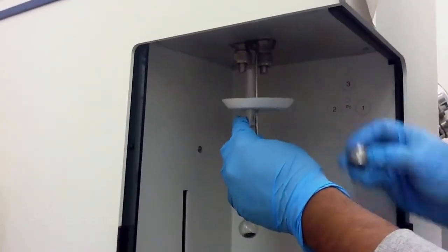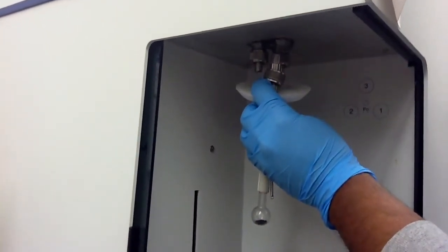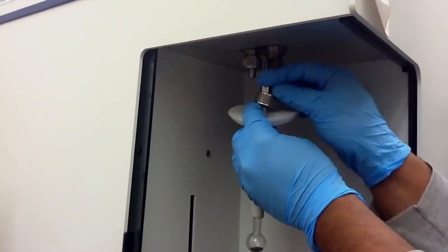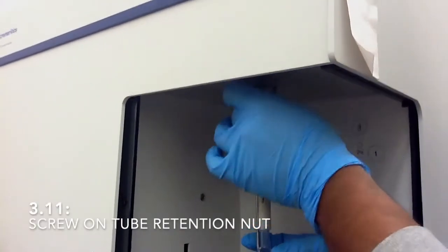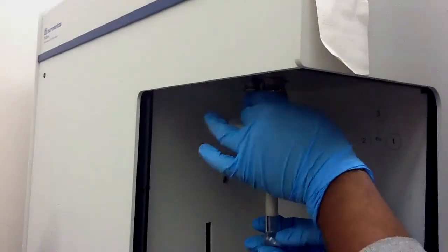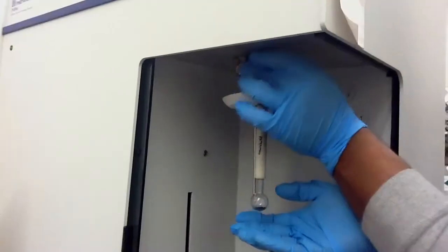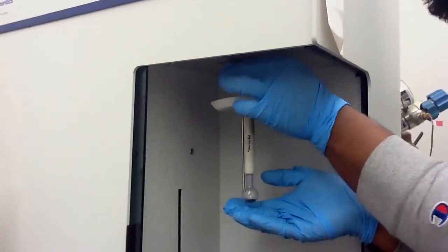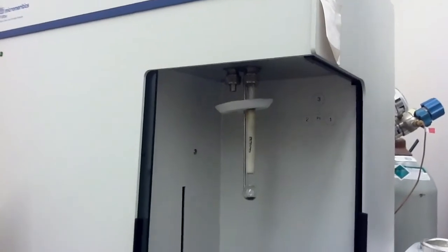Then you need to put it here, this tube, and also put this ring at the top of this glass tube and put it here. And make it tight. So hand tight is okay, just to make sure there is no vacuum created here. So your tube is ready right now.